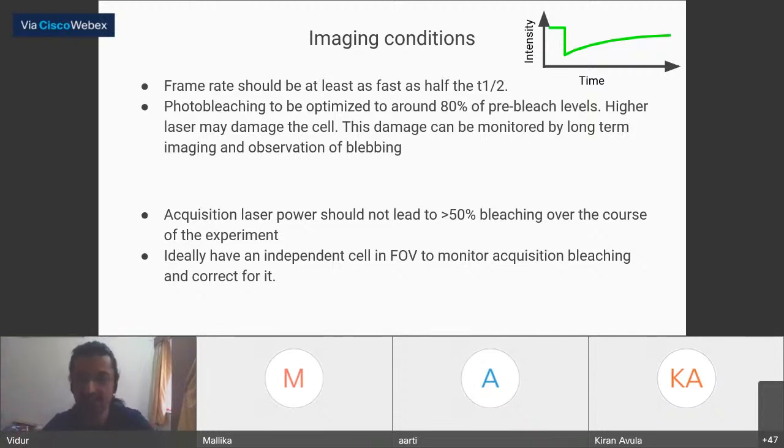The exact intensity may or may not come back, because experiments will always have some amount of photobleaching. But you should always see that the structures that you just photobleached come back to wild type like states. That ensures that there was no damage to the cells, and whatever you are monitoring is because of the dynamicity of the object that you are interested in. I hope I clarified it, Anubhav.